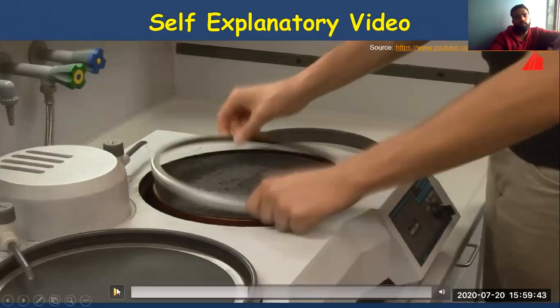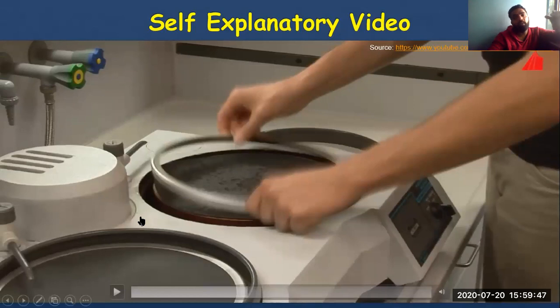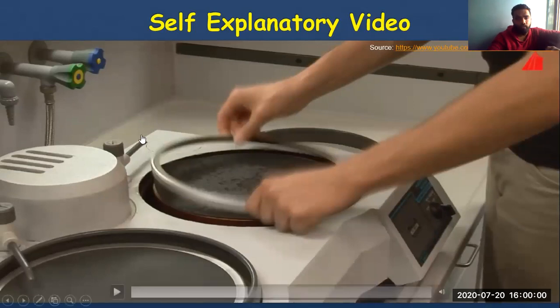We do basic sample preparation, because of which we are not able to view the microstructure that clearly. You can see the precaution that they are taking and the precautions that we take while preparing the sample. We are hardly caring what sample we are going to prepare. You won't even care about it. But when you are in a company or industry, they take serious care because they consider that microstructure to be their work. Okay, and that is important for their livelihood also to earn.